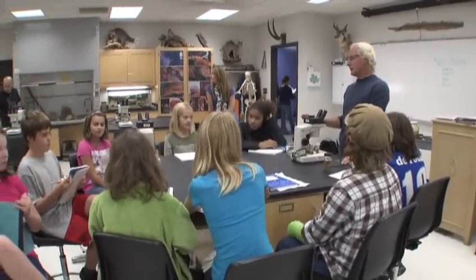Today we're going to do mollusks, soft-bodied mollusks. And we have a whole bunch of things to show you today. So I'm going to start off with kind of telling you what I think a mollusk is all about. And then we're going to show different groups of mollusks to you and pass them around. And then we're going to look through microscopes. And then finally we're going to do some dissections.